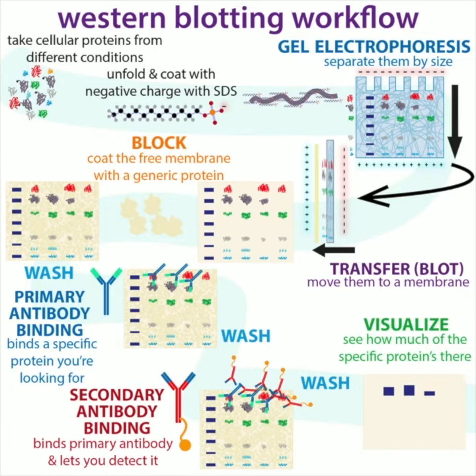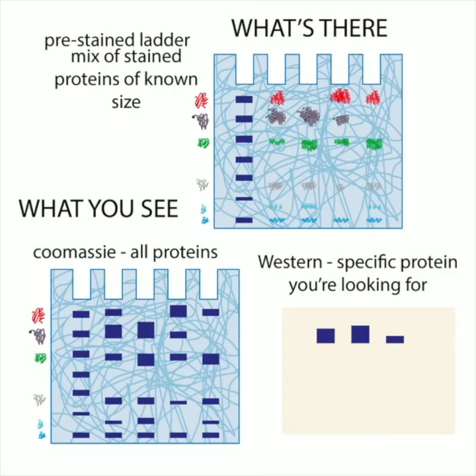And with the Western blot, you're actually using antibodies, little proteins that are specific for the protein of interest. And then you can see if the protein is present. So you should see that protein present in your post-induction sample, but not your pre-induction sample, or at least in very low levels in the pre-induction sample. So ideally, that's the case.